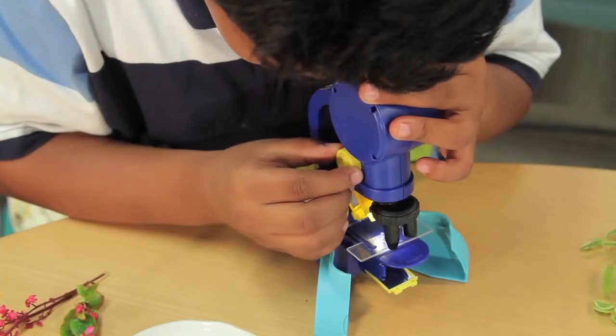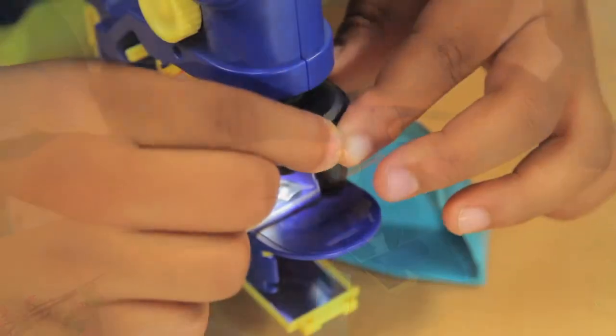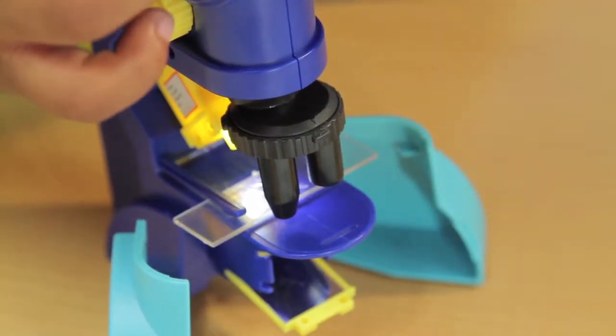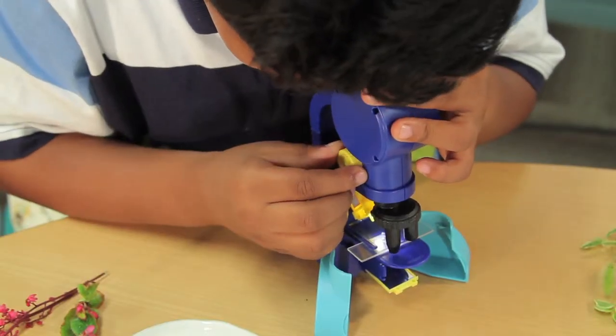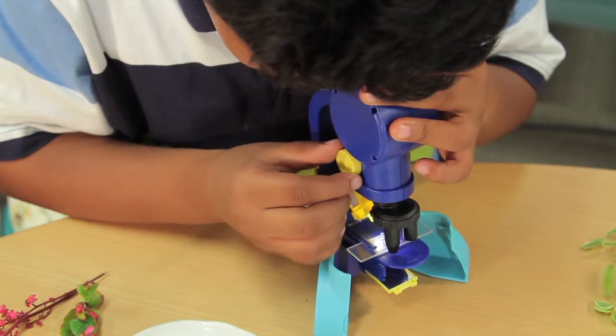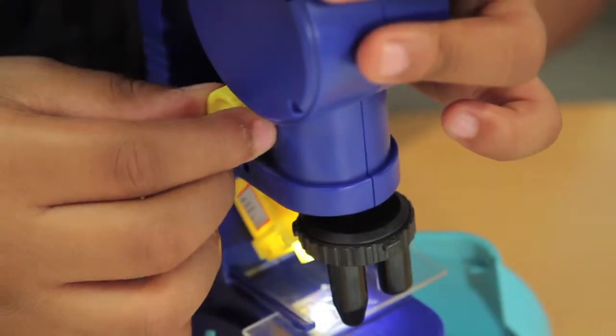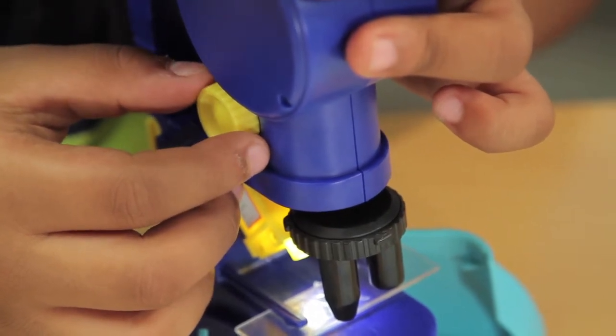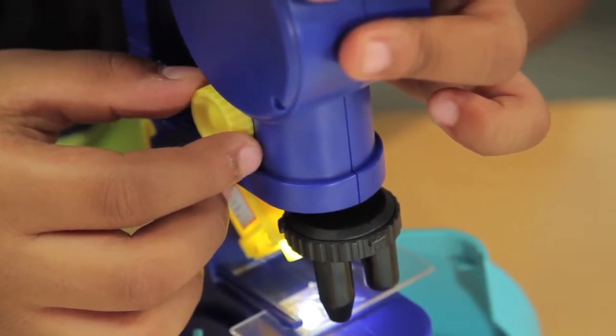Next, adjust the focus. First, set the object lens to 50x magnification. Lower the object lens toward the slide. Look through the eyepiece and adjust the focus. Raise the lens slowly to find the position where the object comes into sharpest focus.